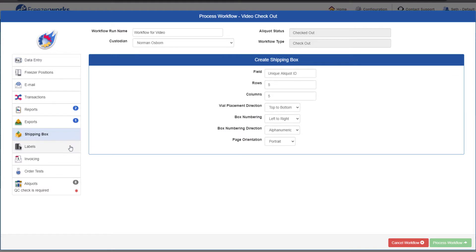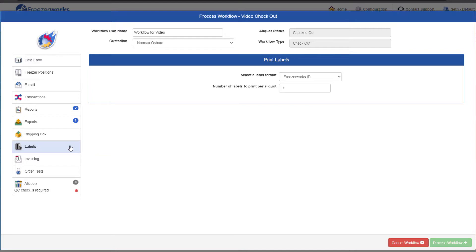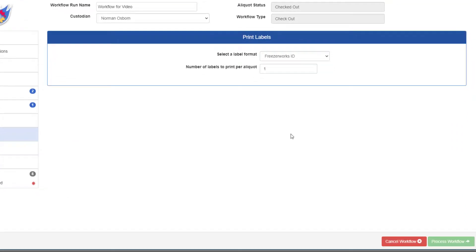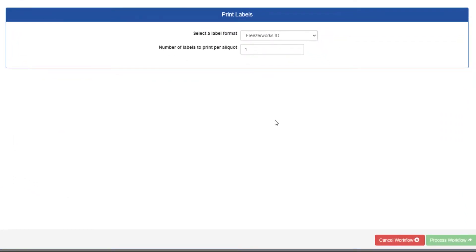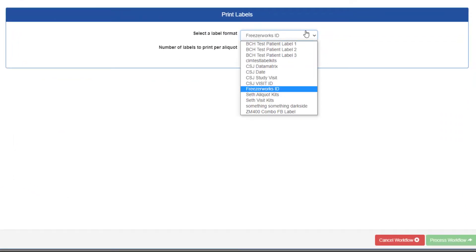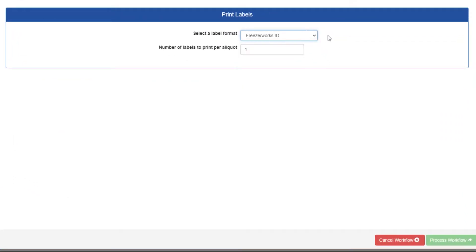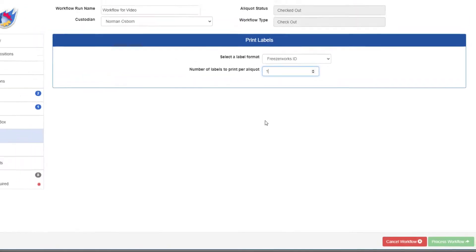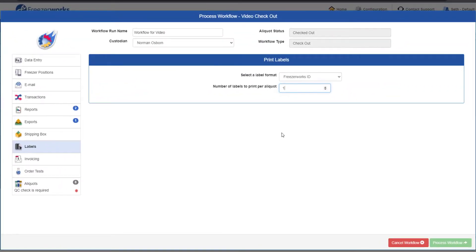The Shipping Box page will make a lot more sense when we go over a shipment workflow. We'll skip it for now. The Labels page has already been filled out for us, but we can select a different label format or change the number of labels per aliquot if necessary.